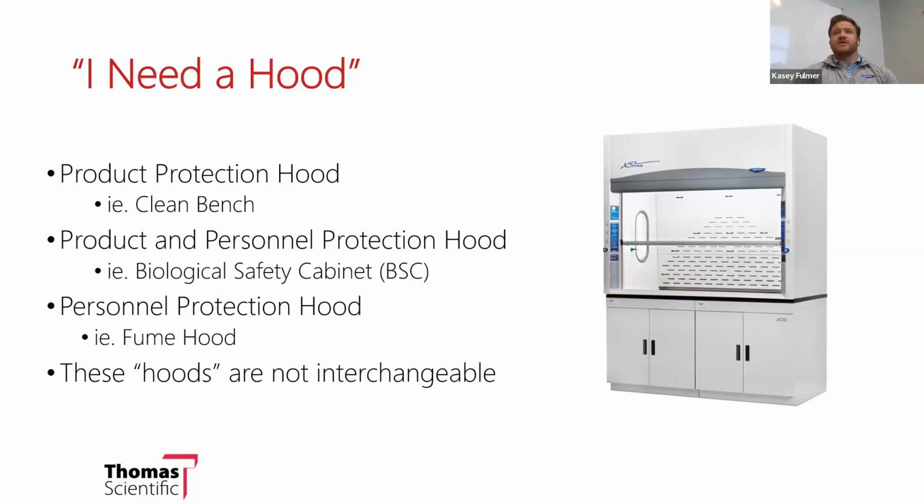The important note here is that these hoods are not interchangeable. If you were to have an application where you were handling hazardous drug powders, and you said, I needed a hood, and somebody provides a fume hood for that application, well, those particulates do not dissolve in the atmosphere. They do not disperse in the atmosphere. So you would just be exhausting that hazardous powder to the top of your building, creating a high probability of exposure to that drug.